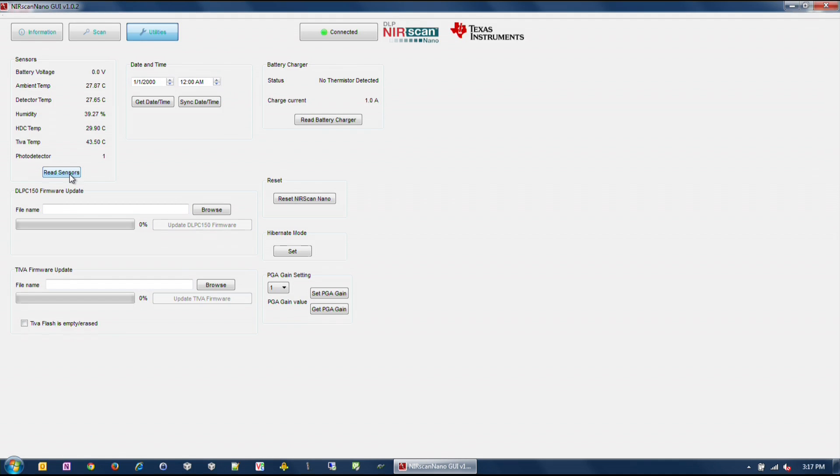You can also view the Teva internal temperature, the Teva firmware update tool, Teva's hibernation module date and time, DLP C150 firmware update tool, and the detector board's PGA setting.